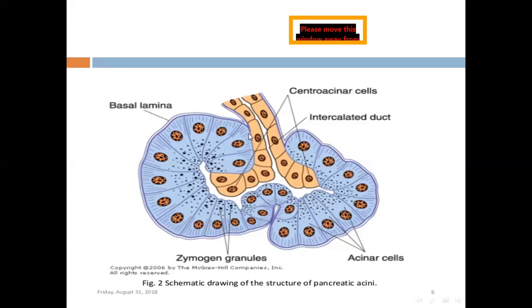The ductal part of the exocrine pancreas begins within the center of the acinus, starting with the central acinar cells. Central acinar cells are composed of pale cells, followed by the intercalated duct, which is also pale low cuboidal.